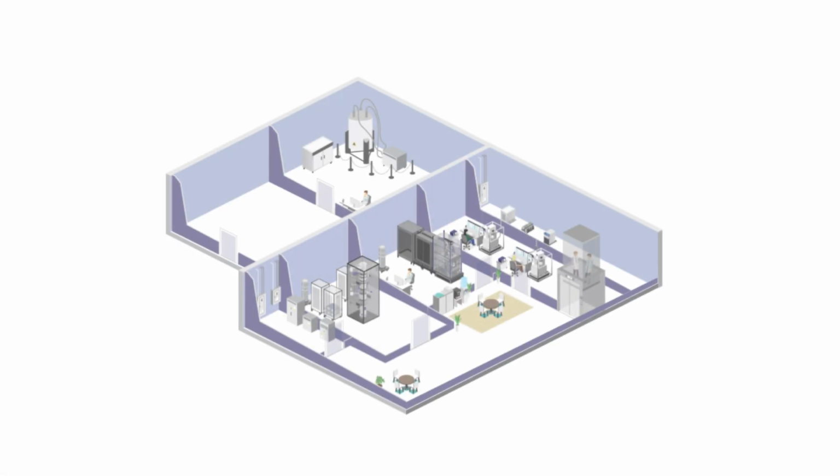In addition to the movement of large ferromagnetic objects, you also have equipment in a facility that can impact your lab space as well. So NMR machines, MRI machines, etc. Things like that can be problematic. NMRs, when they're operating in a steady state, they typically don't cause any problems, but as they ramp up and ramp down, they can result in significant beam drift throughout the duration of that ramp and are really problematic.